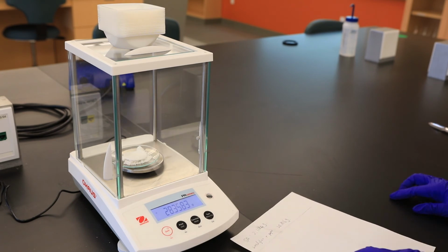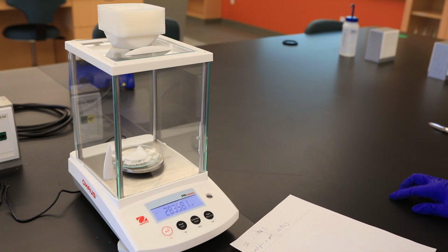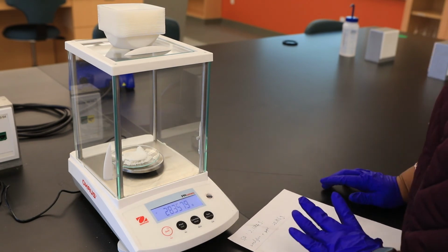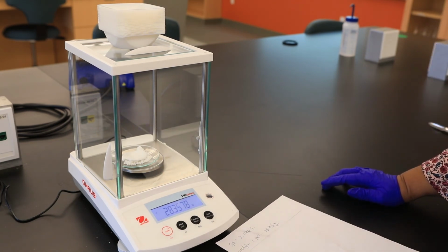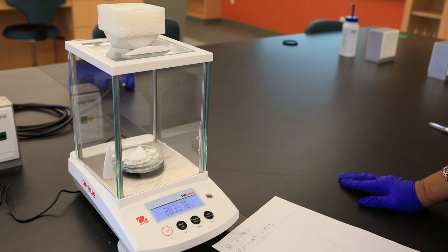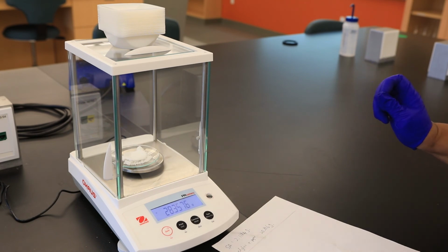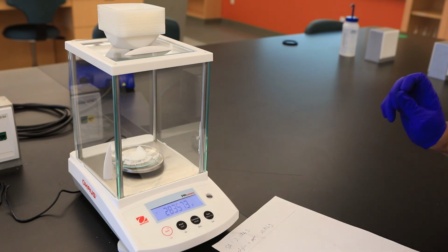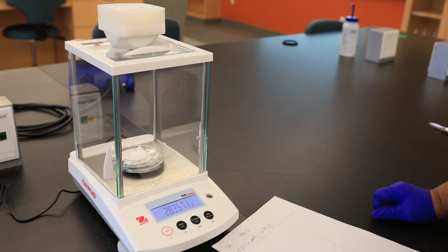That mass is the actual mass that you obtained, and the theoretical mass is based on that balanced chemical equation. And then finally, the last step in this experiment requires us to heat our sample. And so if I remove a small amount of aspirin, and place it in a test tube, and heat it using a Bunsen burner, what you will be able to detect is the smell of vinegar.